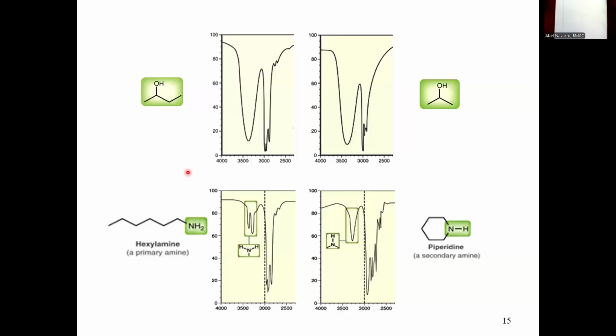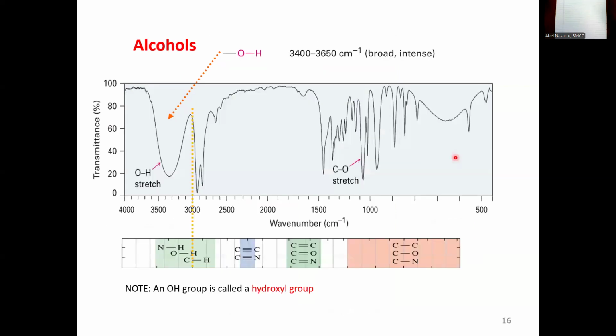There's one specific OH that is kind of tricky, but also very useful, to be honest. That's the OH, right? Really broad peak. The CHSP3s, the CO. Remember that they're telling you the CO at 1100. I see it right here, kind of intense, right? We are right now in this particular region. Great.